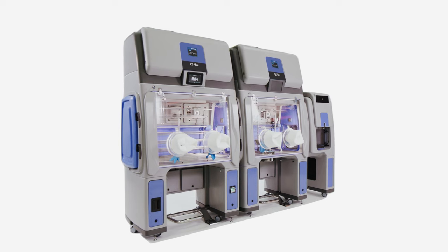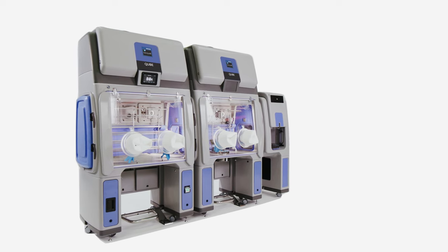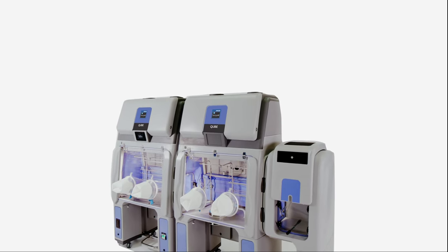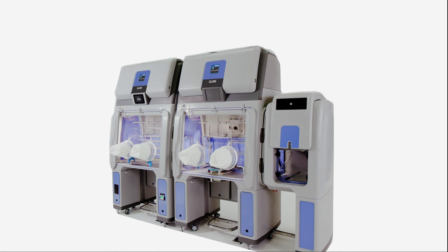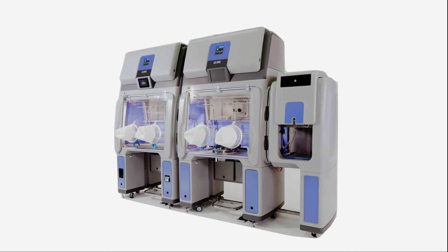Compared to stainless steel, the BioQuell Cube weighs significantly less and offers greater maneuverability. Combining these benefits with its small footprint allows any configuration to fit through most doorways and only requires a standard outlet to function, saving you from considerable operational downtime and potential construction costs.